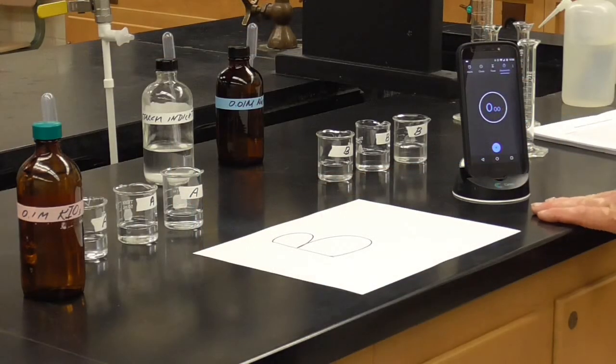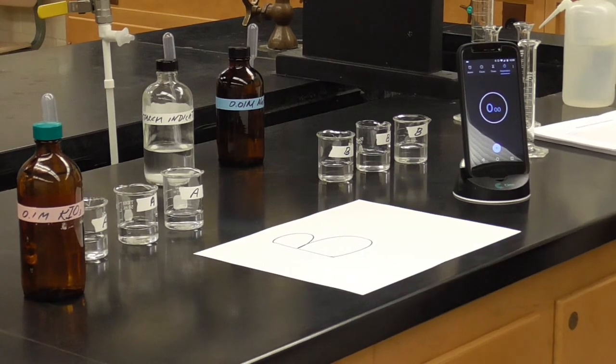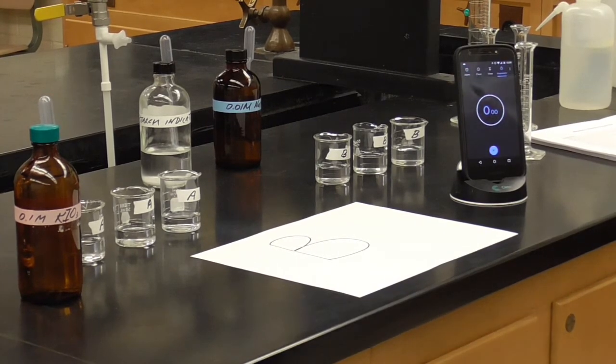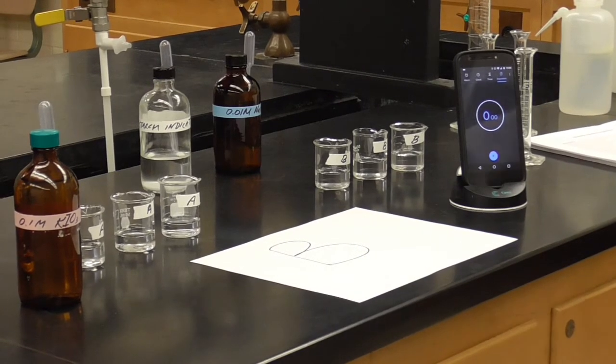Part B. Here we're going to look at concentration. Again, how crowded together are these molecules? How much do we have per volume? The reaction we're doing is the classic iodine clock reaction, as it's called. It's actually a 2-step reaction. It's in your notebooks. You can read about that. And when the first reaction is done, the second reaction kicks in and makes the solutions turn color.